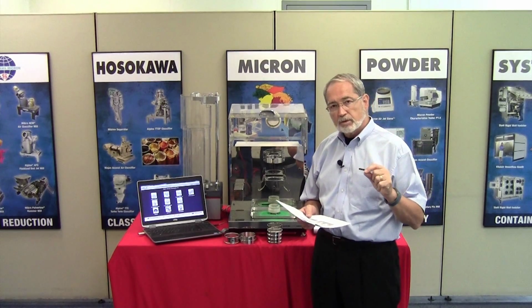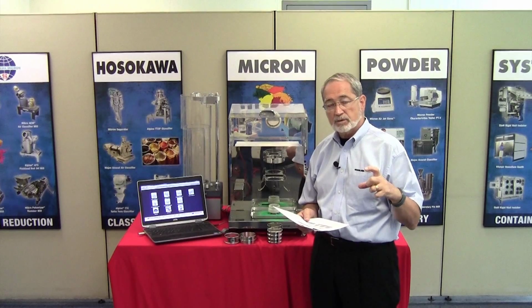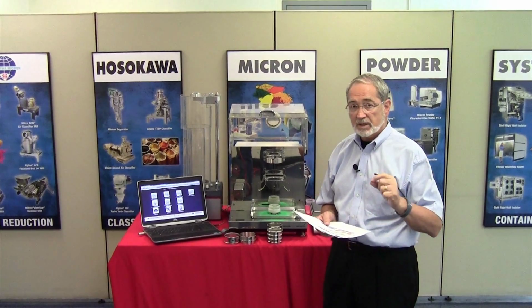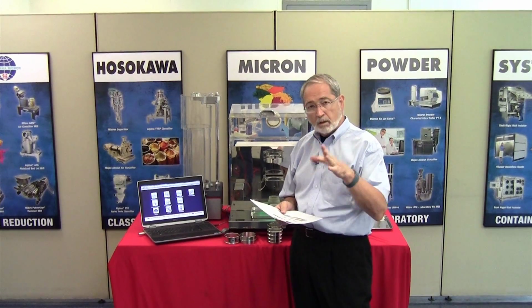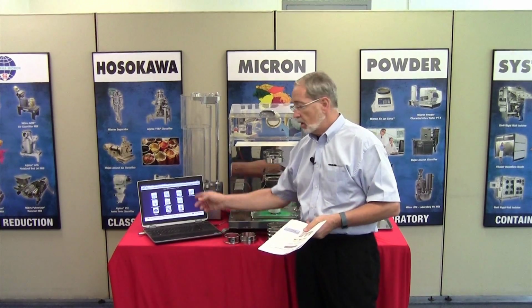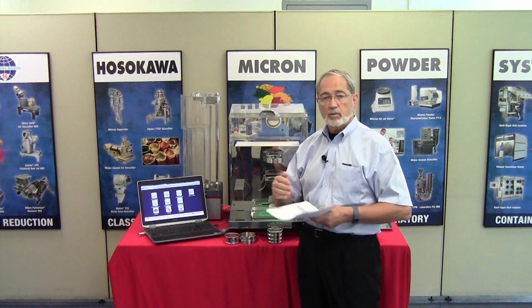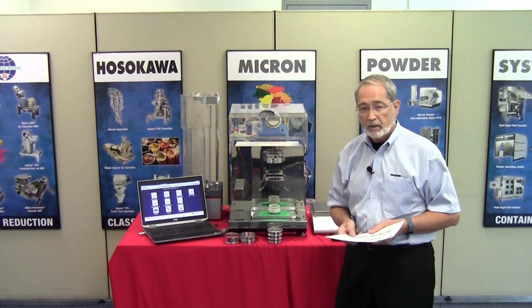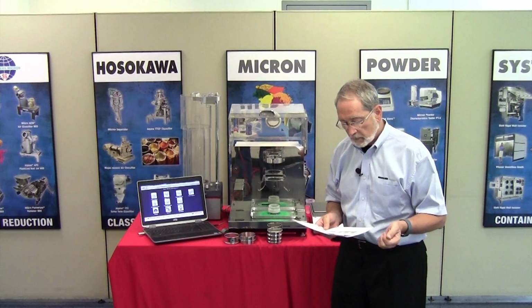In order to perform the uniformity test, what we need to identify is the D10, which is the diameter at the 10 percentile, and the D60. So that's the diameter at the 60 percentile. Those two micron sizes are inserted in fields that will then calculate the particle size uniformity of that particular sample. Now, how does that relate back to cohesion?